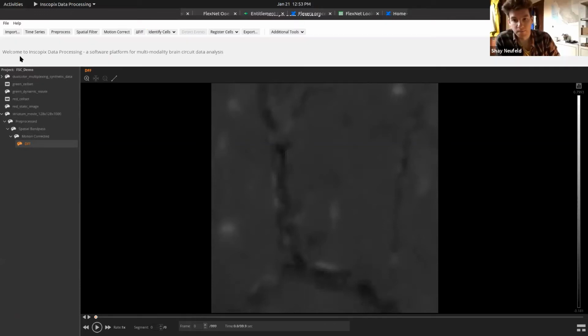No, I'm just thinking about how people want it for publication purposes, or usually what they want is a scale bar. One workaround is if you can see the whole lens, you can measure it and then enter your known value, and then it converts all your measurements.